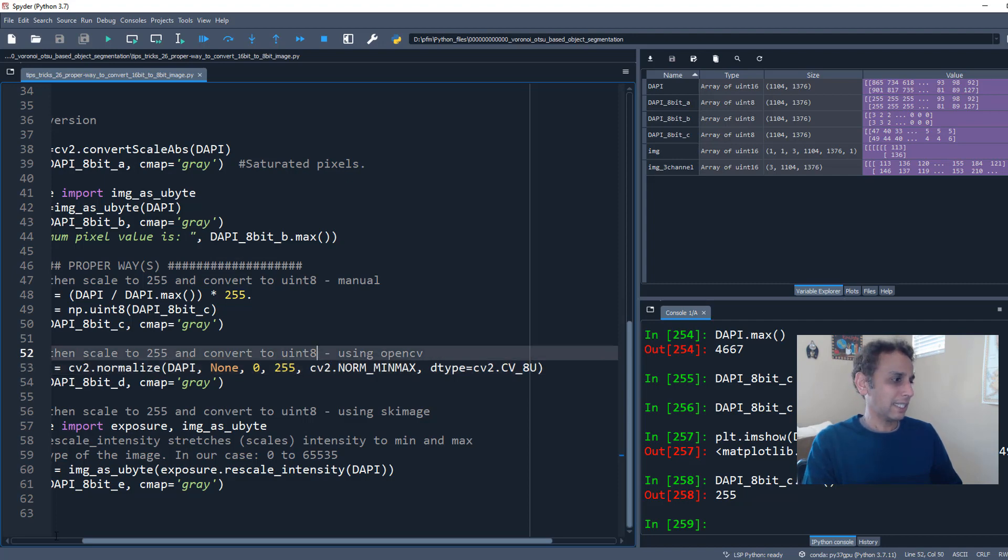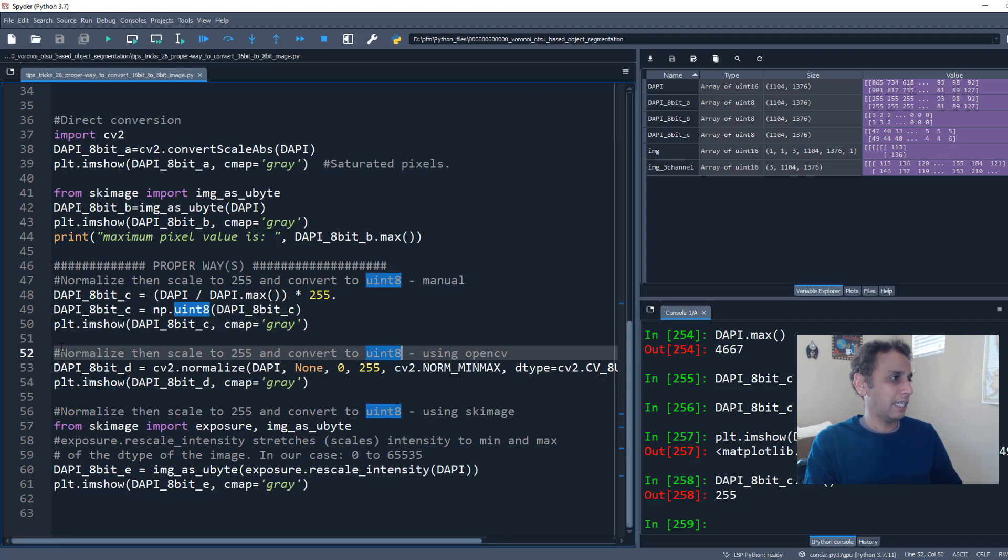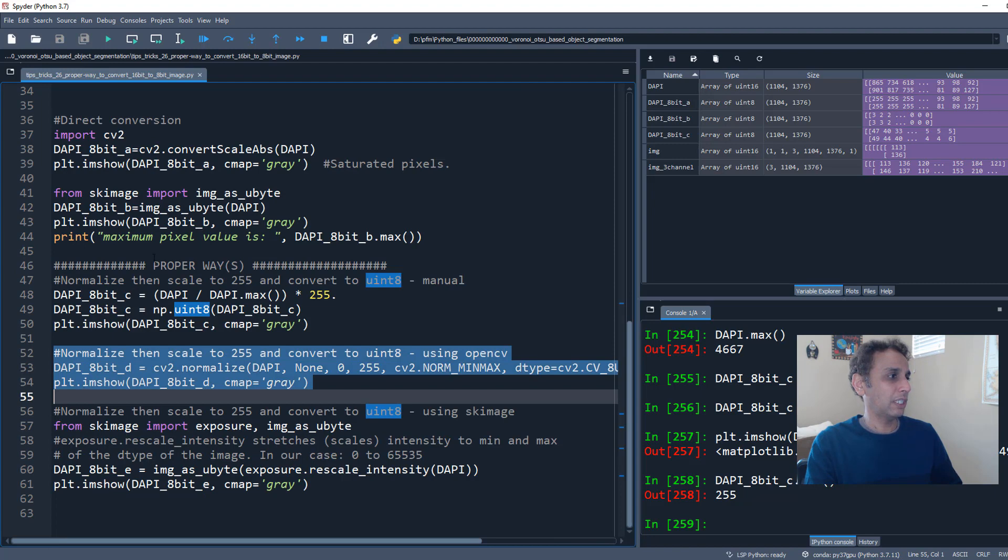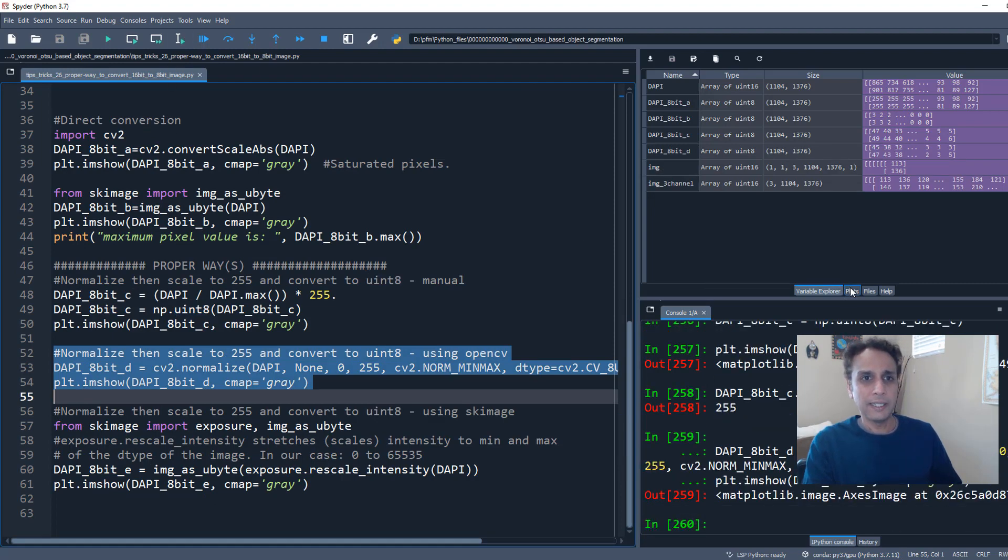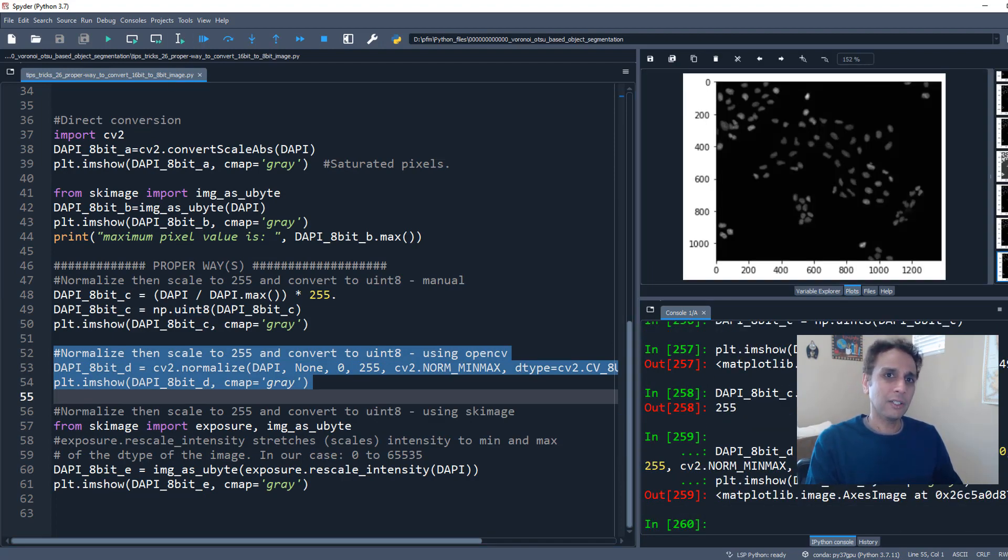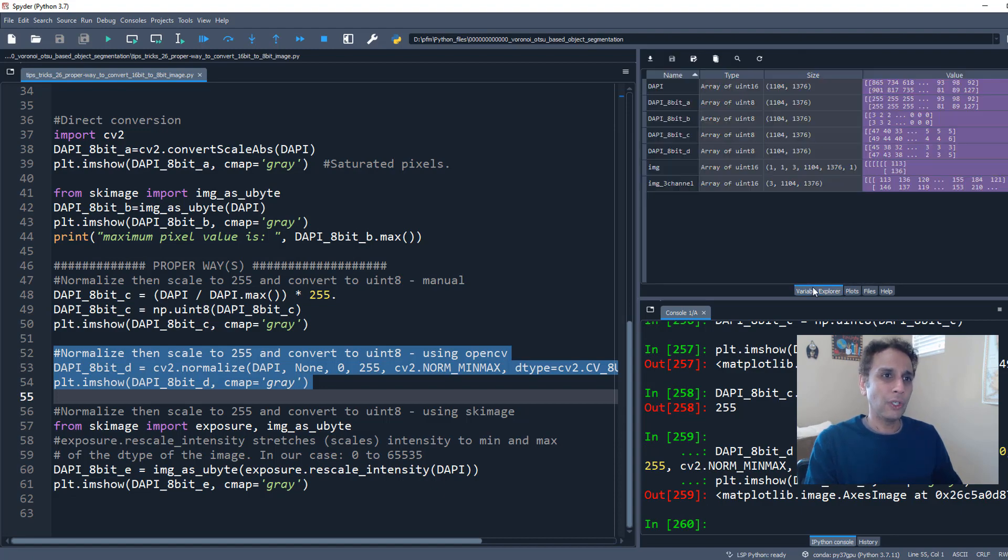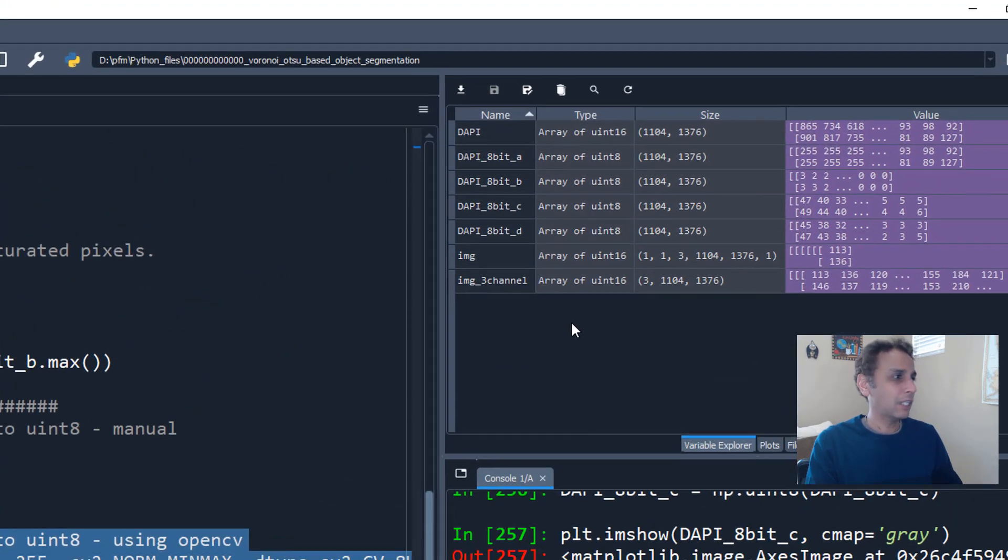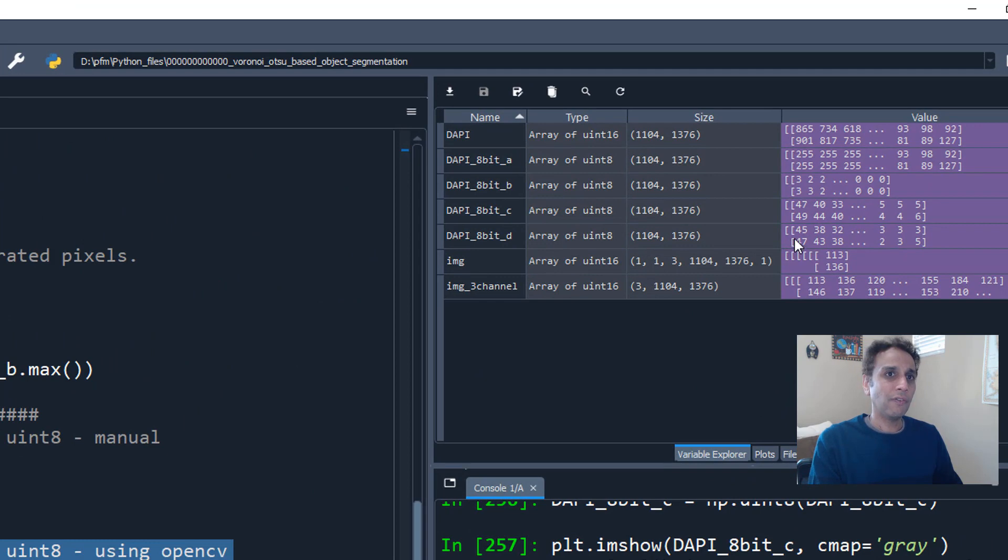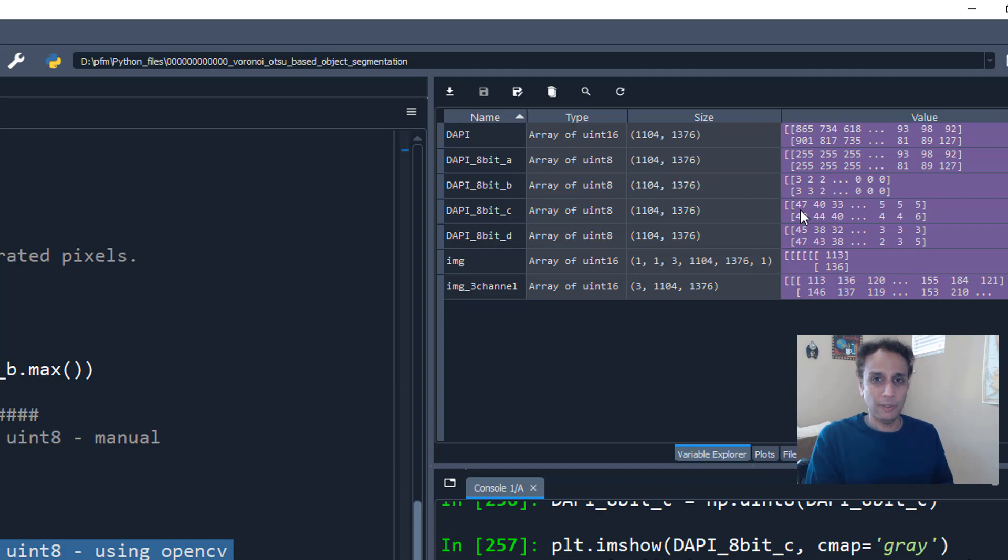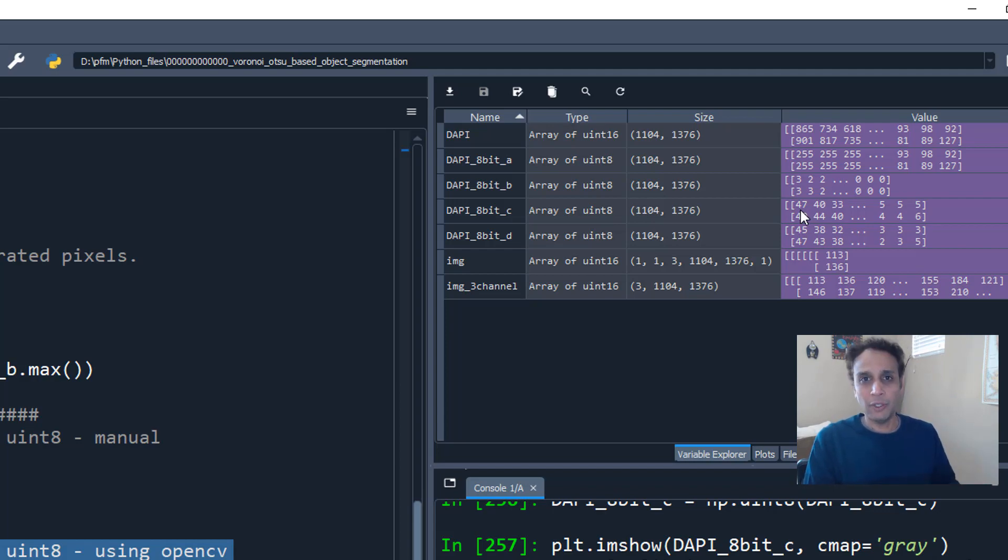So when you do this, and let's go ahead and plot it. Hopefully the image should look great. Right there. It looks identical to before. And also when you look at your values, this is what DAPI_8bit_D right there. 45, 38, 32, almost identical to what we got using our manual method. When I say manual, it's NumPy. Okay, let's finish this off by doing this another way, which is Scikit-Image.